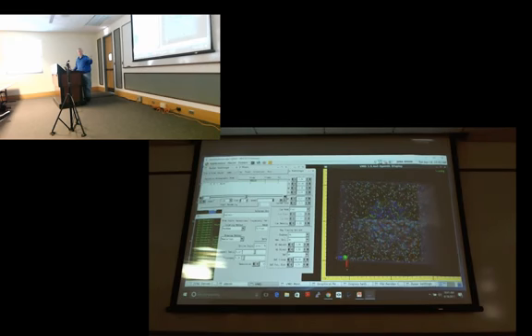The ions, when you get to the corners of a perspective view, things in the corners get distorted because it's kind of like looking out of the corner of your eye. If you put your face that close to the monitor, it doesn't look distorted, but when you're standing far back, it would be an unnatural perspective. It's like when you look at paintings, you want to stand at the right distance to appreciate a painting because they were intended for you to view it at a certain distance. And if you look at a distance other than that, it doesn't look right. With an orthographic view, it looks the same no matter what distance you look at it from. But with perspective, it can look very unnatural and strange if you rendered it with an extreme field of view, but then you're standing very far back. It looks very weird, or vice versa.